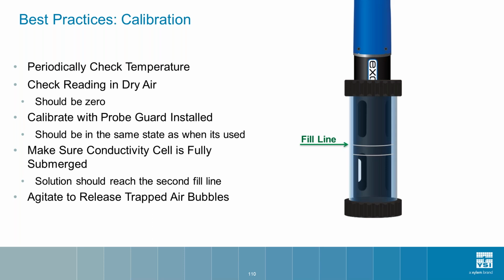We do recommend agitating or jostling the sensor to dislodge any potential air bubbles that could be trapped in the conductivity cell, as they can skew the calibration.